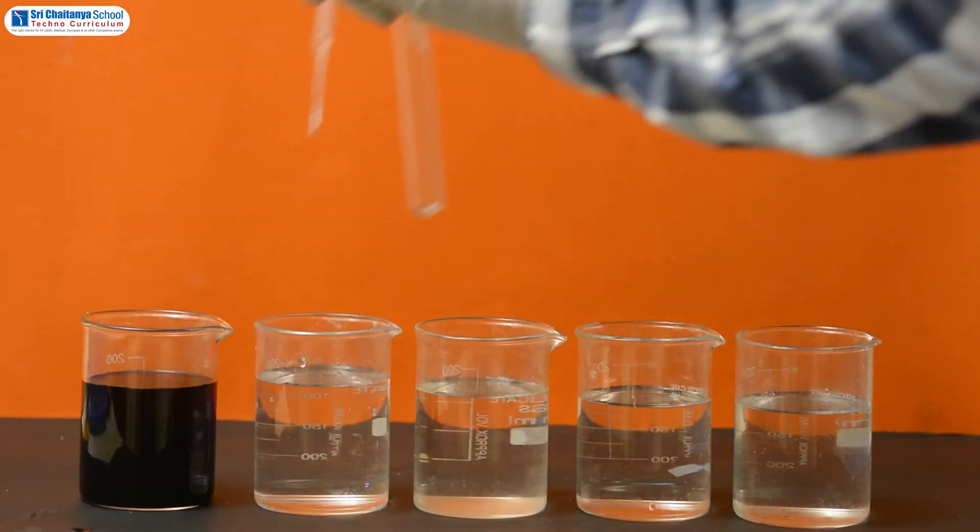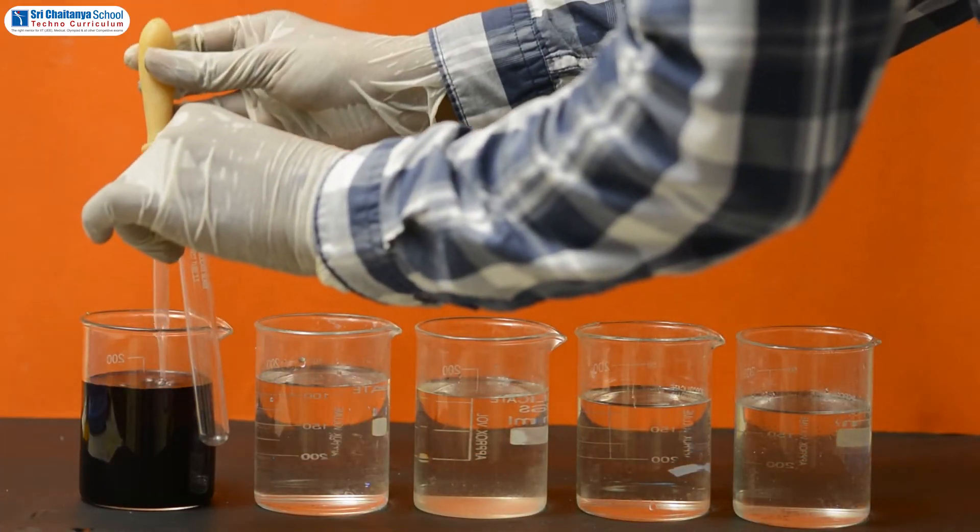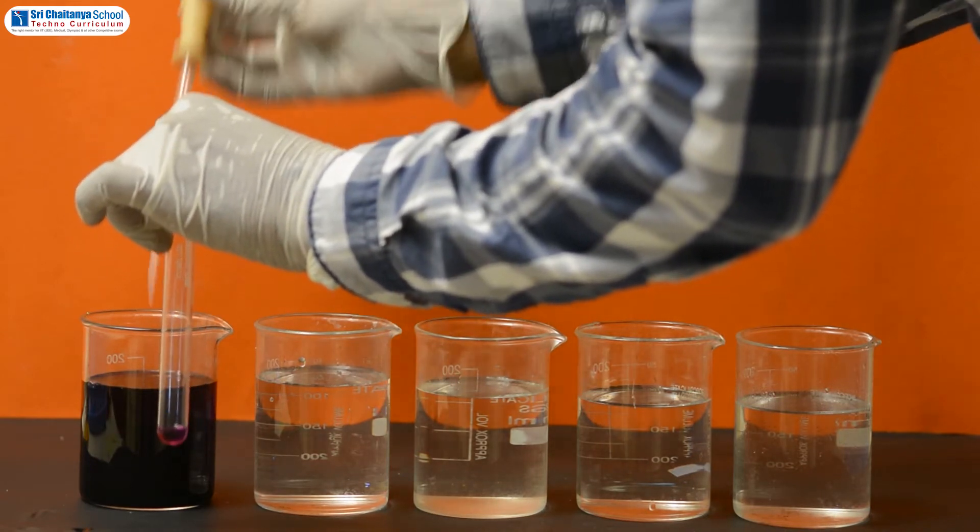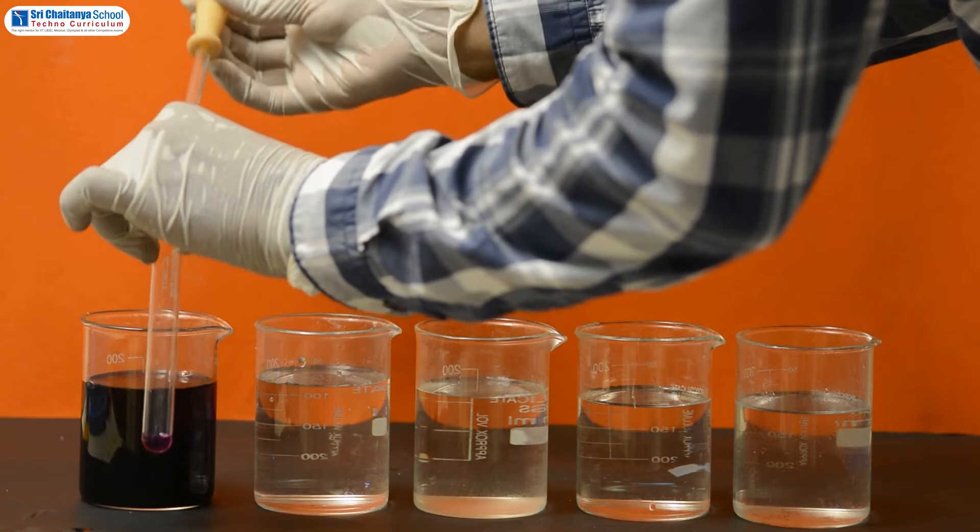Now take out approximately 10 ml of potassium permanganate solution and add it to 90 ml of clean water in another beaker.